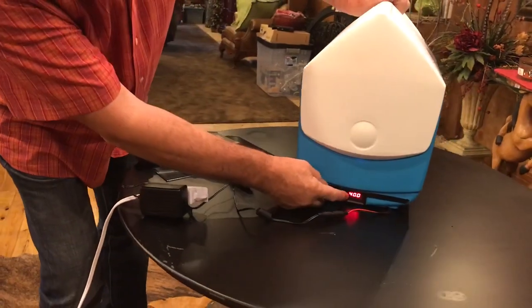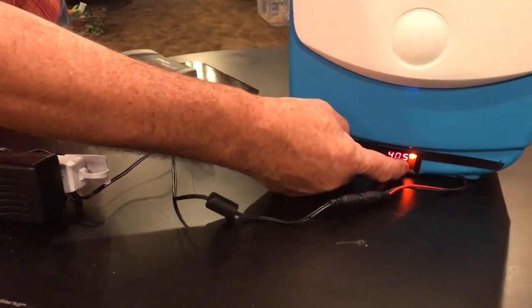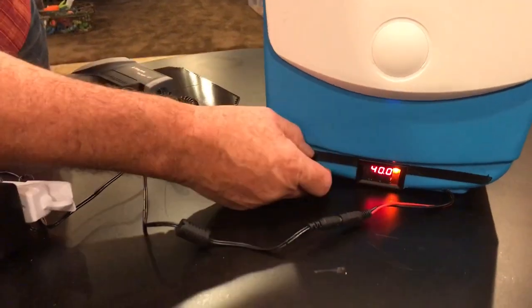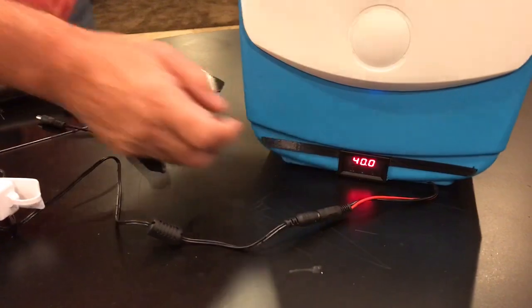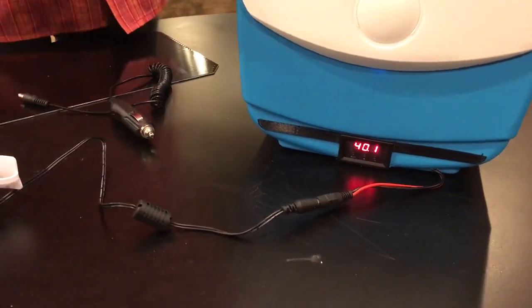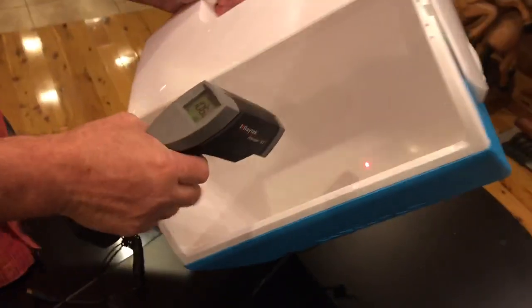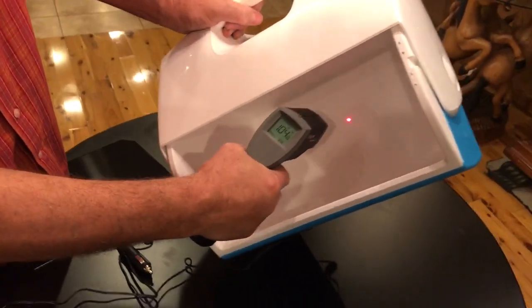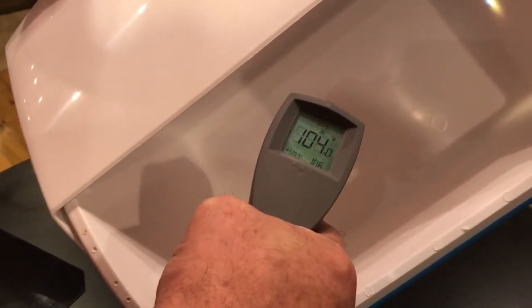I can very quickly change it. I press a button once like this, and then I can make it go up or down in very small increments. So I'm going to set it back to 40, and there it is. You see the red light comes on. It means it's heating up. And does it work? This is actually measured in Fahrenheit. 40 is like 104 degrees. There you go, 104 degrees.